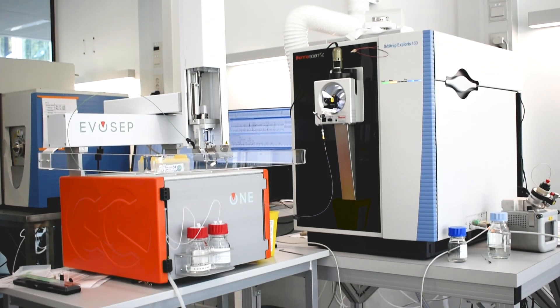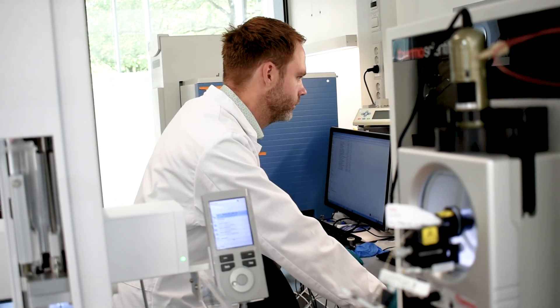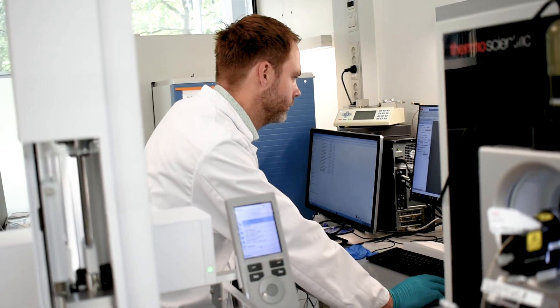In this video I would like to tell you a bit more about our Exploris 480 instrument from Thermo Fisher Scientific. This is a highly specialized instrument that has an ultra fast scan speed. It can be combined with FAIMS, an ion mobility device that allows gas phase separation and fractionation in order to get even more sample depth.